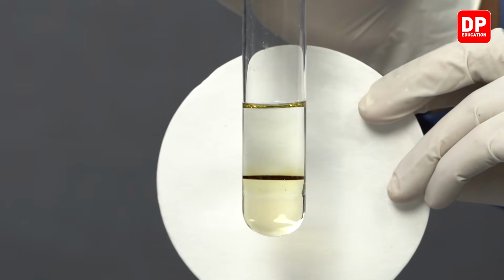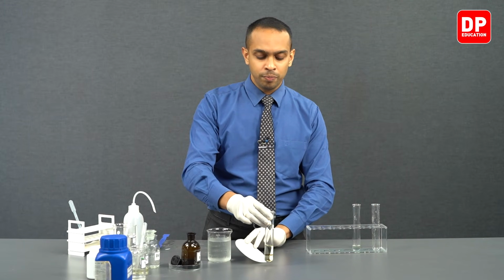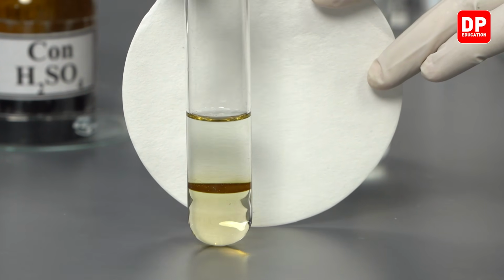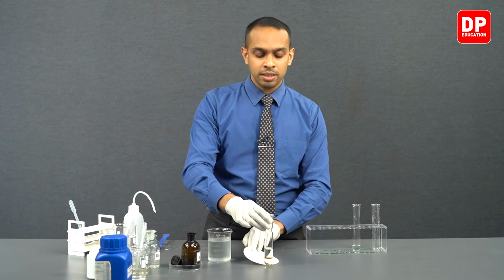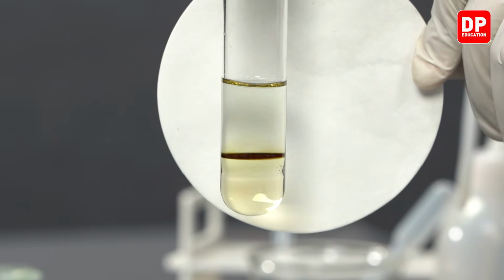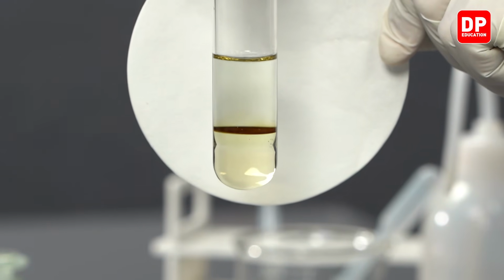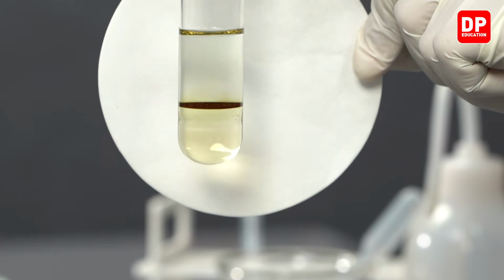So we can very clearly observe this brown ring over here. If I keep it down on the table, you can see how at the interface we have formed a brown color ring. So this is referred to as the brown ring test for nitrate ions. This is a very specific test that can be done to observe the presence of nitrate ions with the use of Fe2+ aqueous ion solutions and concentrated sulfuric acid.